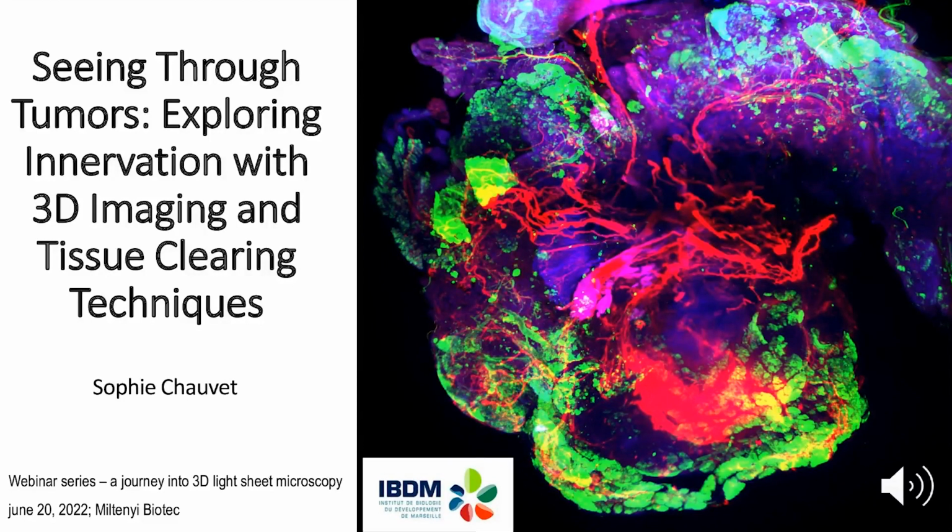Okay, fantastic. Thank you. One more question that we've got come in. Can the ultramicroscope light sheet system be used to image larger organs beyond the size of the pancreas? So this for sure, this ultramicroscope is really amazing. The chamber that we could use is really large, large enough to image a whole mouse, and even larger than one mouse. So it could clearly be used to image larger tissue than the pancreas.